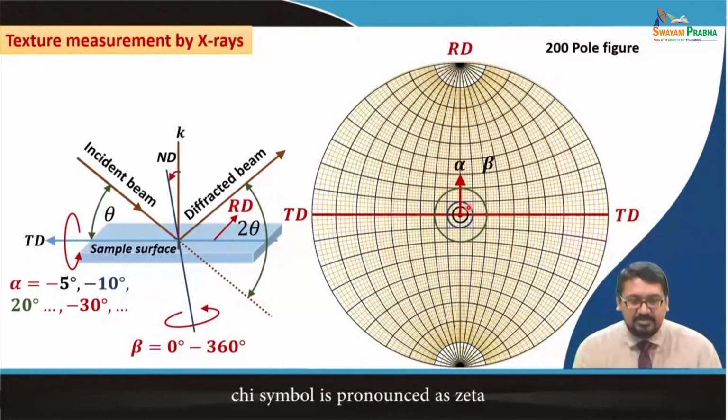Now, let us say we go to alpha equal to 30 degrees. I am showing this because it is easier to understand here, as it is a larger circle. When we are here, alpha is equal to 0, and then we go here, that is alpha equal to 10, 20 and 30 degrees.